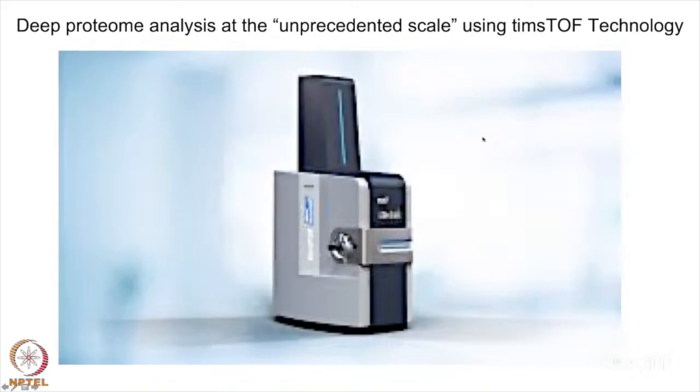Now what we are going to do, we are going to show you a new technology, one of the latest in the field, the timsTOF technology, which does 4D proteomics analysis. Fortunately, at our startup, in collaboration with Bruker, we have now acquired this timsTOF technology. I now request our team at Proteomica to share their video and do a live demo to talk about the timsTOF technology, which we think is giving us an unprecedented scale of data.